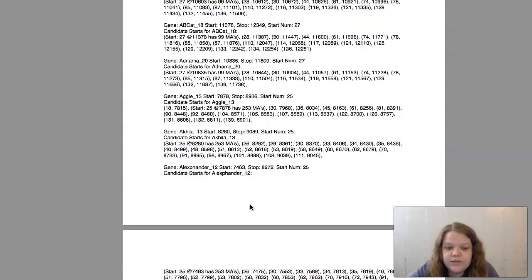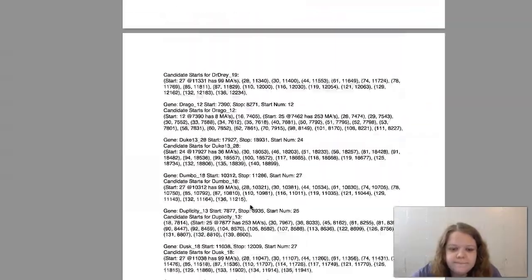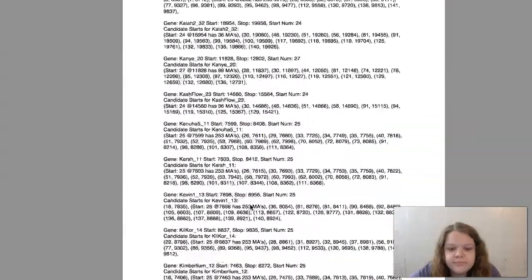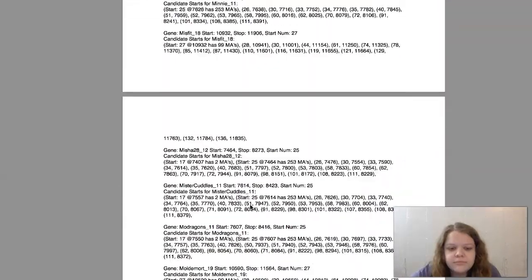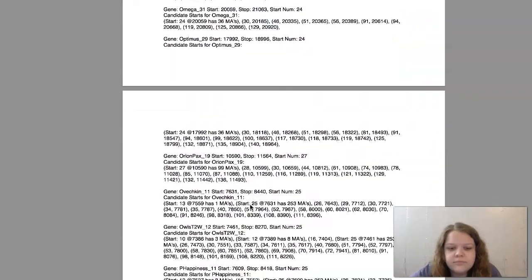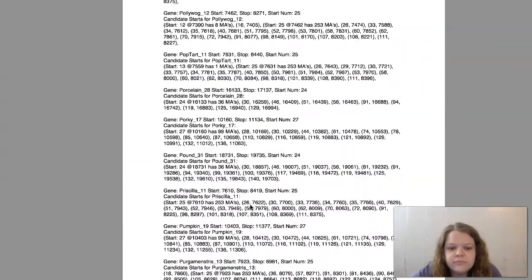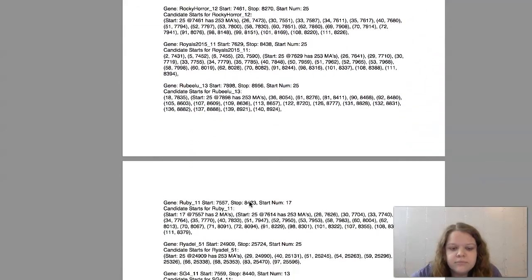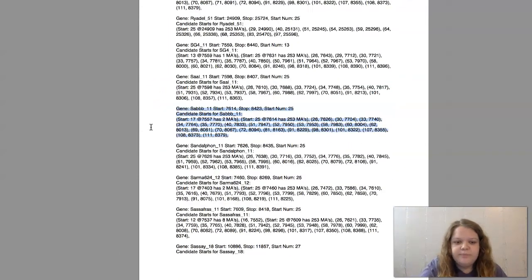They are in alphabetical order, so now we are going to scroll and try to find SOB. I have now located SOB's text report.